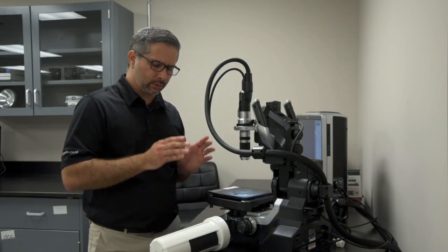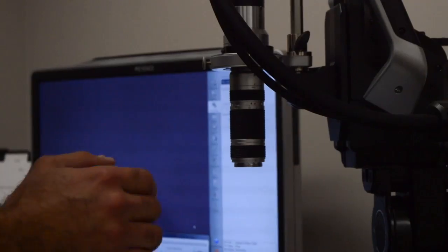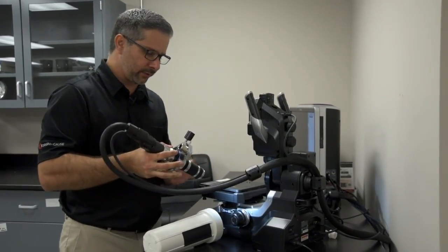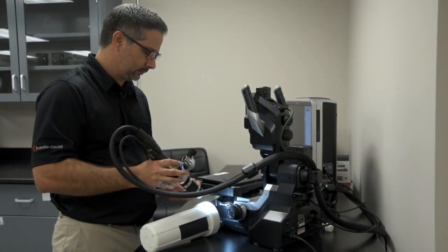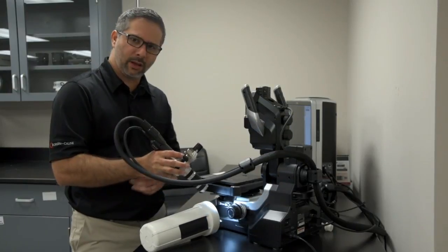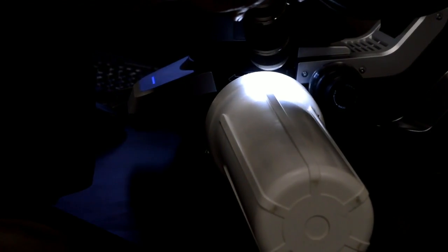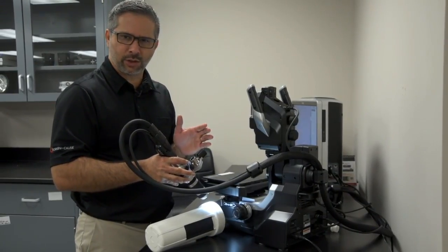So what I want to do now is look at the fracture under the microscope and try to understand a bit more on how and why it failed. I'm going to take the microscope top off. It's a lot easier for me at this point to handle this larger object. And so basically what I'm looking for is that morphology of the fracture, to understand a bit more on where it initiated, how it propagated, and all of that morphology linked to the origin of the fracture.